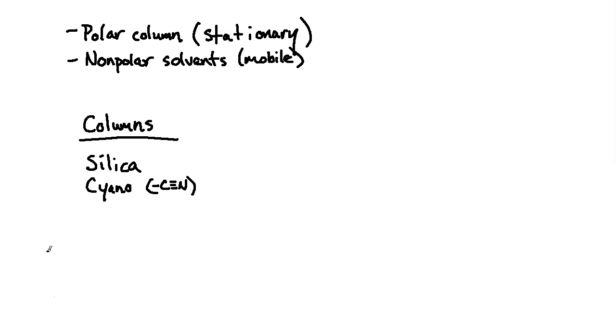And we did see some of this towards the bottom edge of the reverse phase: C18, C8, C4, and then if that still wasn't working, maybe you could start dabbling in the cyano adaptations, right?